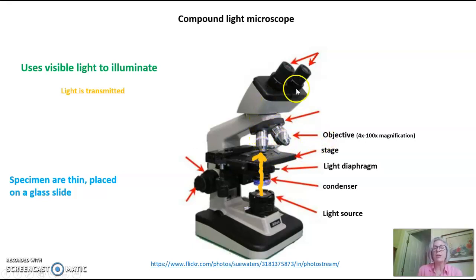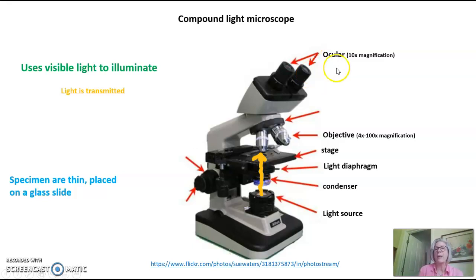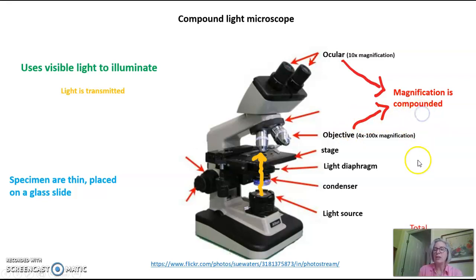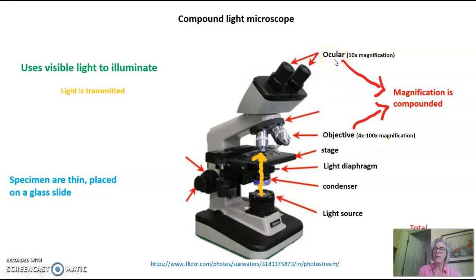The light goes through the objective and then up through the ocular, or eyepiece, which is where you actually look in the microscope. The ocular is a second place where magnification occurs. Because there is a double magnification, we call this a compound microscope — the magnification is compounded. So the total magnification can be anywhere from 40x to 1000x: if you use the 4x objective with a 10x ocular, that's 40x total; or a 100x objective with a 10x ocular gives you 1000x total magnification.